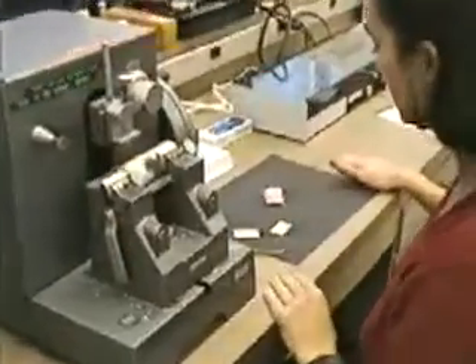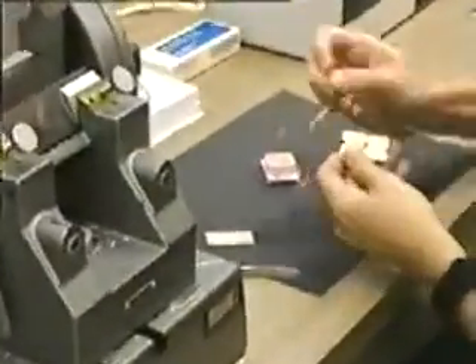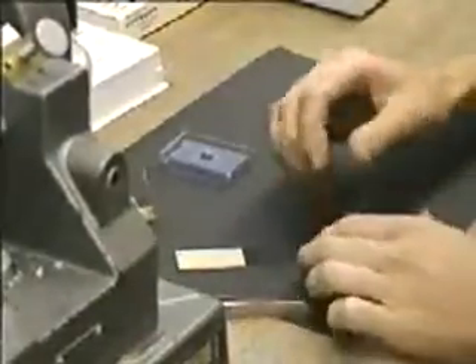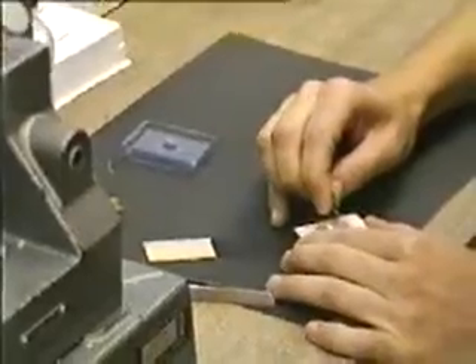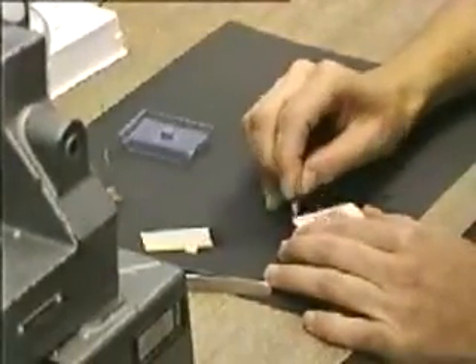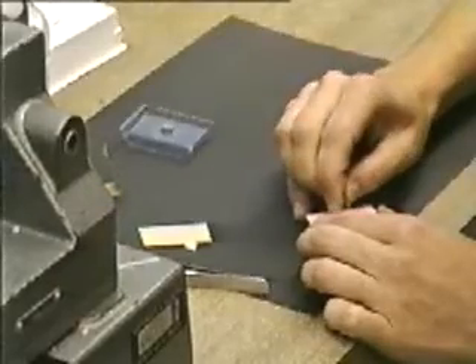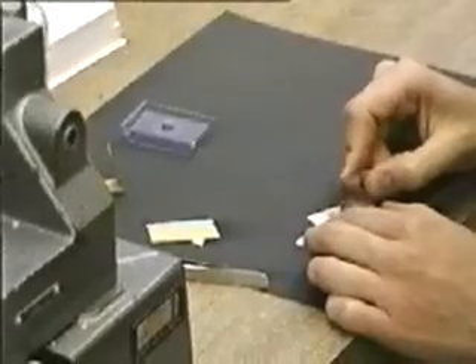The hardened paraffin embedments are trimmed with a fresh razor blade so that excess paraffin is removed and the block is shaped somewhat like a truncated pyramid. Careful trimming is necessary for further orientation of the specimen and for good quality sectioning to take place later using the microtome.